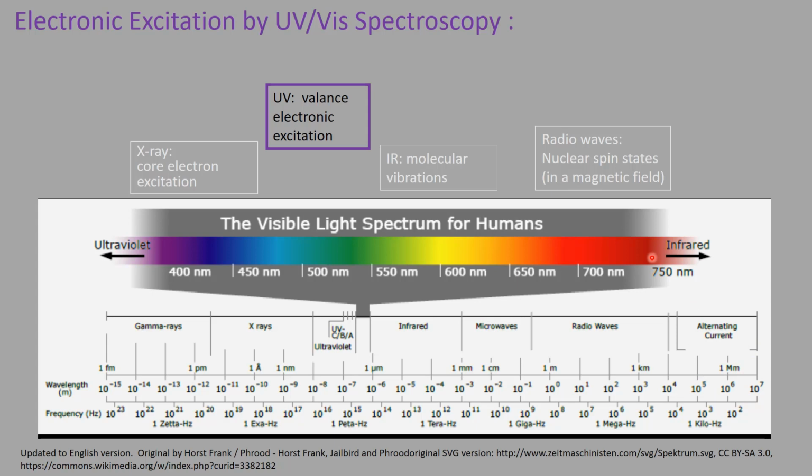Okay, so what we're going to be looking at for this lab is mostly in the visible light spectrum and in the UV spectrum. So it really only takes place right through here. All the rest of this we're not going to be using, but I wanted to remind you that it exists, right? Because we'll look at it later.